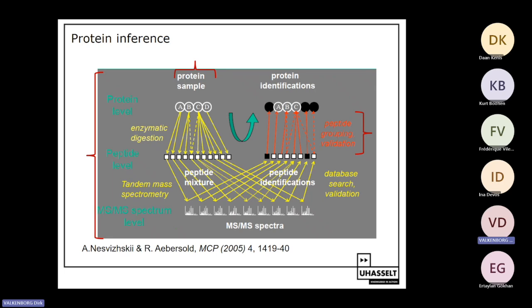And there are several strategies that you could use. You could come up with a minimum set, so, for example, a minimum set of proteins that explains the observed peptides. You could also come up with the maximum set and say that every protein that could be explained by this set of peptides should be in my list of discovered proteins. So there are multiple approaches.